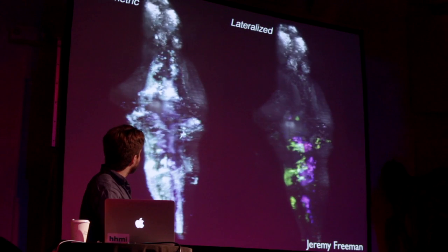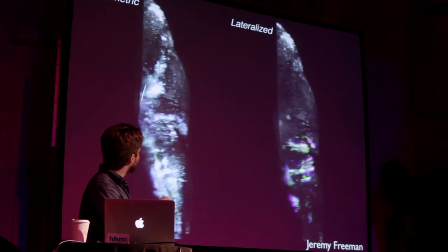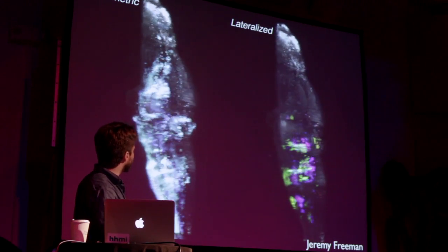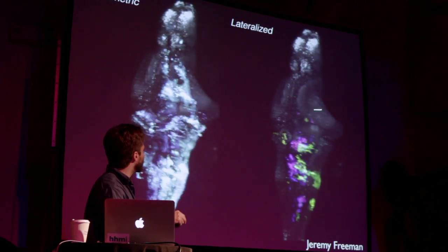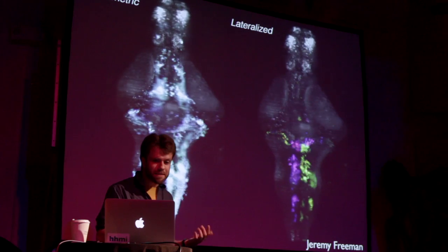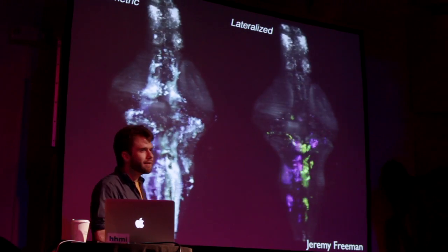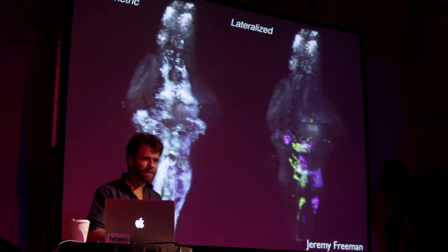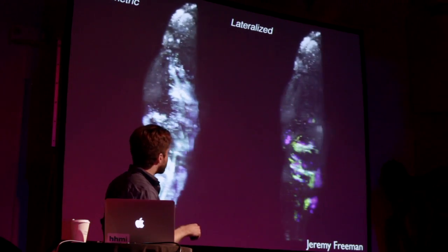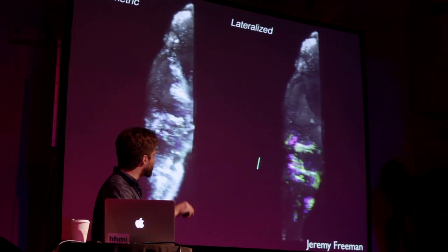This is the volume corresponding to a forward-tuned behavioral component. So these neurons and pieces of neuropil are active when the fish swims forward. And this volume describes which pieces of the data are active when the fish is turning left or right, in green and magenta. And just from this very simple analysis, in a sense, we have this two-dimensional behavior, the left and the right side of the tail. From simply doing a regression based on these two variables, we get this very clear anatomical structure.